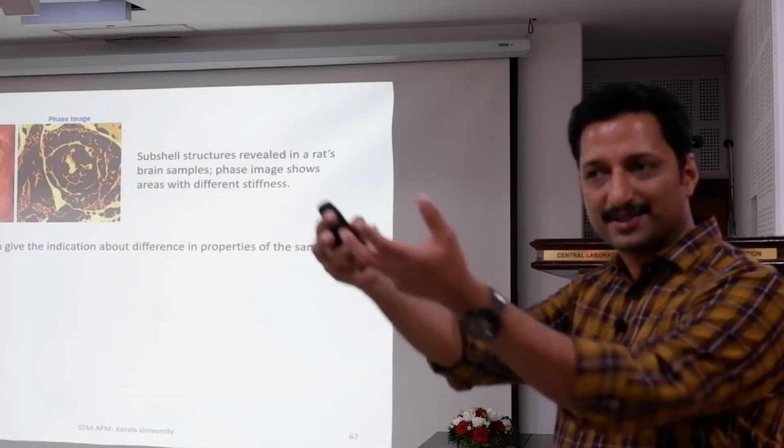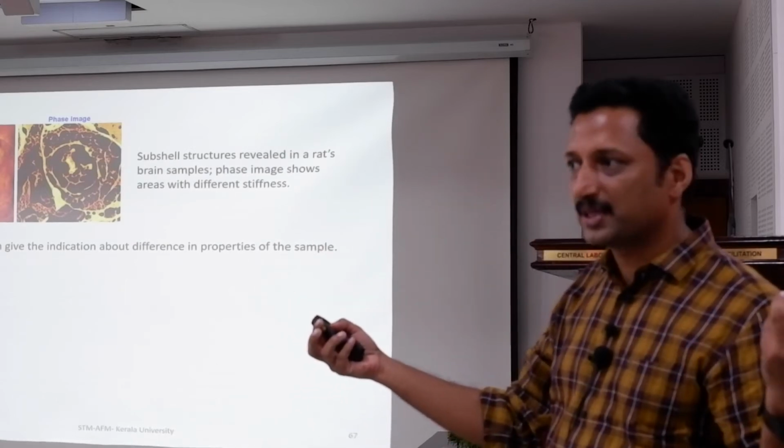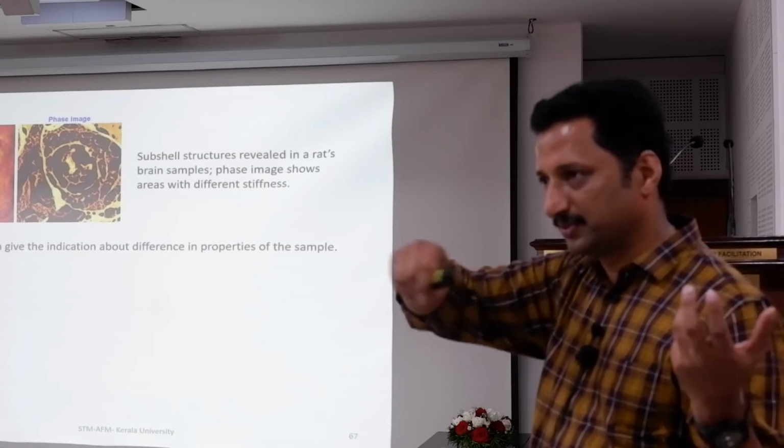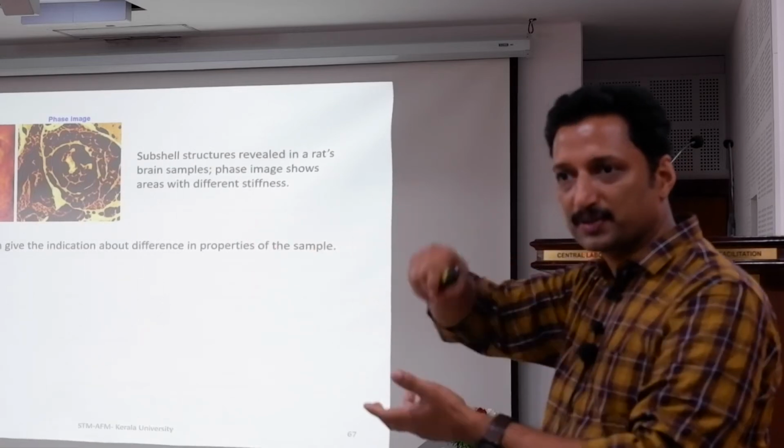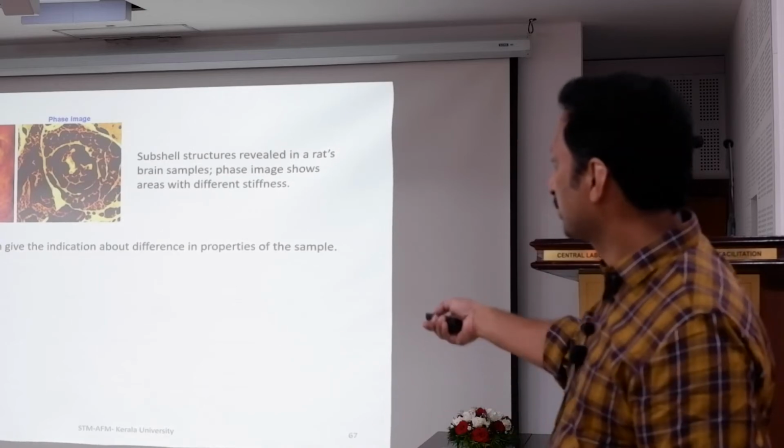In different ways we are getting the same signal. We are splitting into three. Okay, one is the phase. What is the phase difference while it is scanning? What is the amplitude difference while it is scanning? What is the height profile we are getting? So height profile is called the topography.